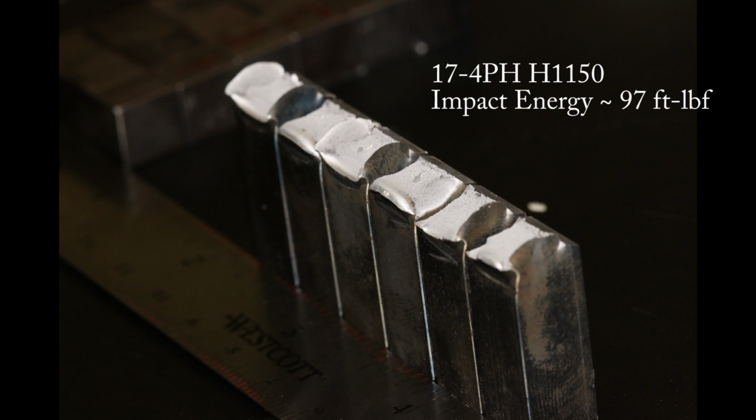For 17-4 PH in the H1150 condition, we measured the impact energy to be about 97 foot-pounds for these samples. So not quite double the H1025 and not quite quadruple the H900 condition. So what you can see is that you're giving up not a ton of strength to gain quite a bit of toughness as you increase the heat treatment temperature. But again, this is always based around what your design constraints are, and so understanding what's required of the design is really important.